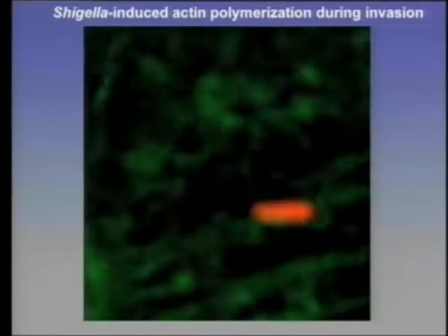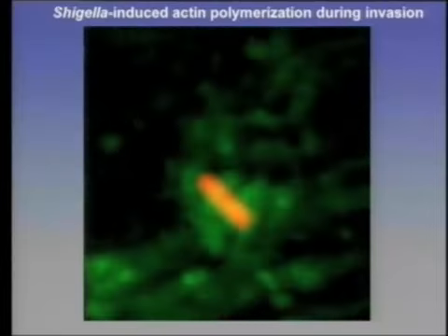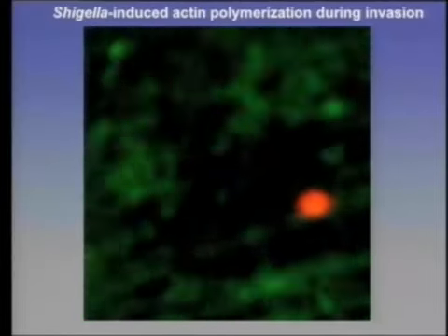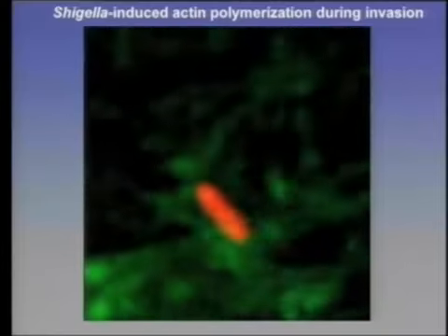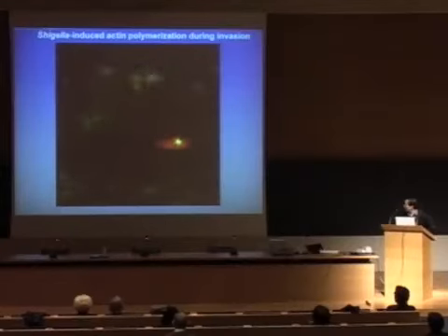So that clearly suggests that the formation of this polar compartment is linked to bacterial division, and perhaps the processes that are involved in the polarization of the substrate here are the same, or at least some of them are the same, as those involved in bacterial division. So eventually I just want to show you the slide here. Again, this is Shigella that induces actin polymerization. You can clearly see that actin polymerization at the very early stages occurs at one pole of the bacterium.